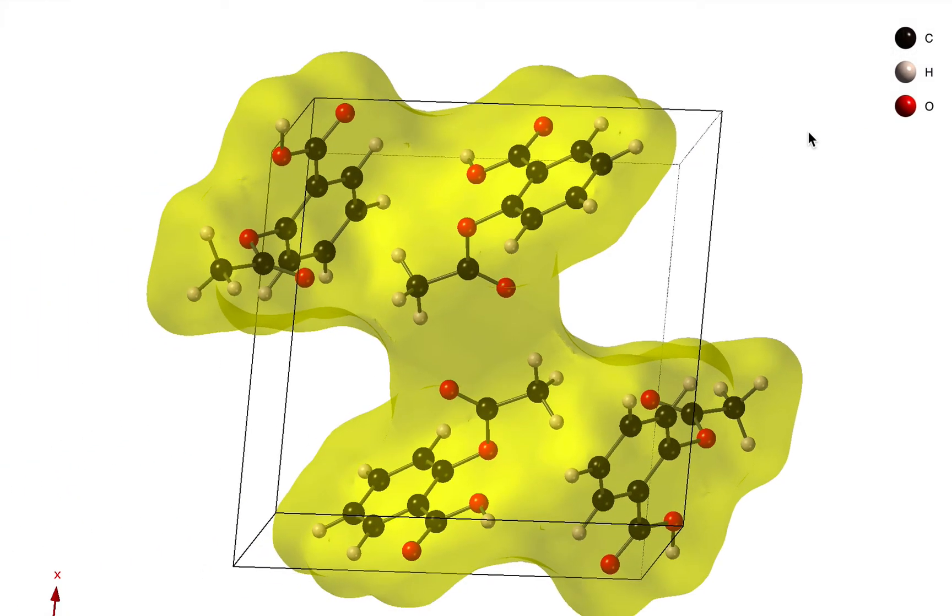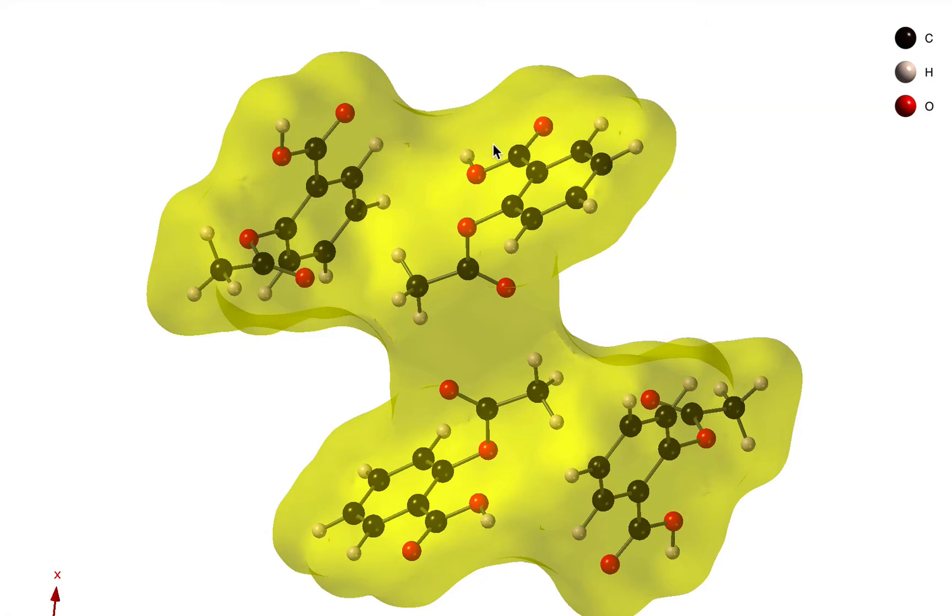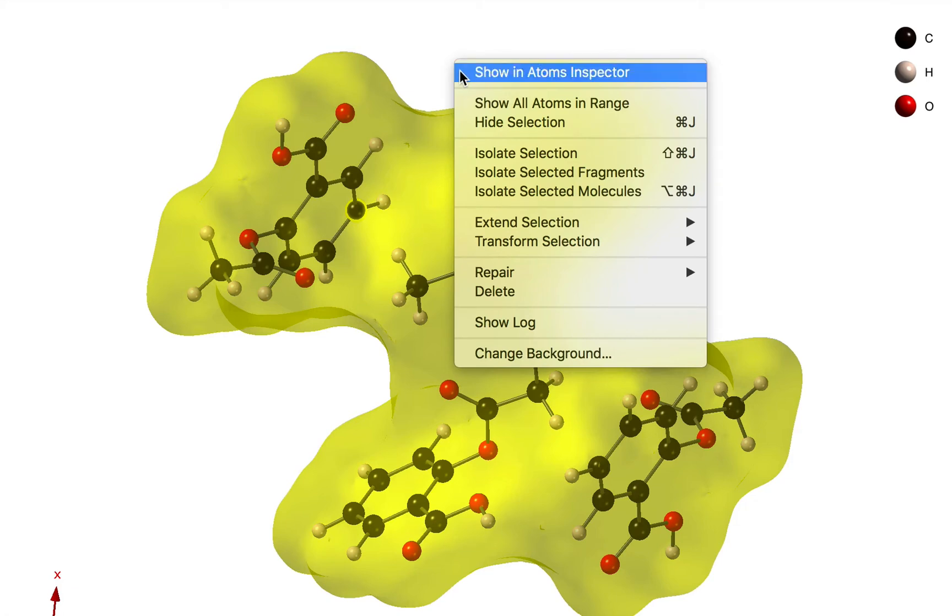Now this is for a crystal structure. Let's say that we actually want to just show a single molecule and the shape of that single molecule. So what I'm going to do is hide the unit cell and just click on one atom in the molecule that we want to focus on. We can right click and we can do isolate selected molecules.